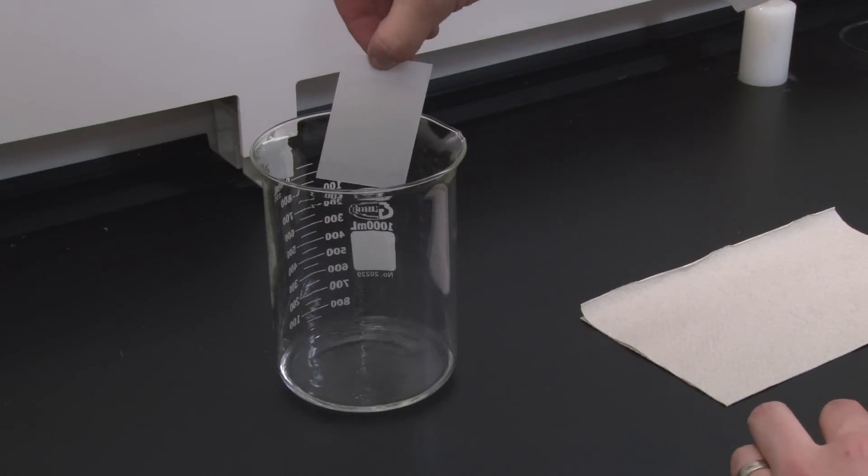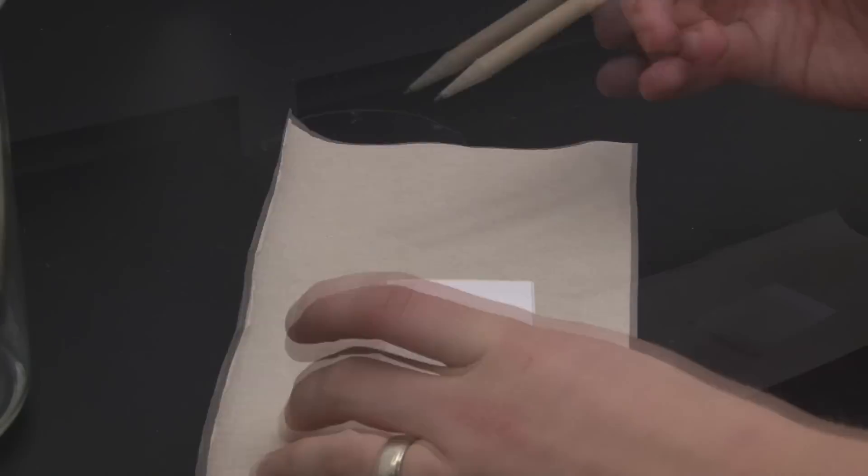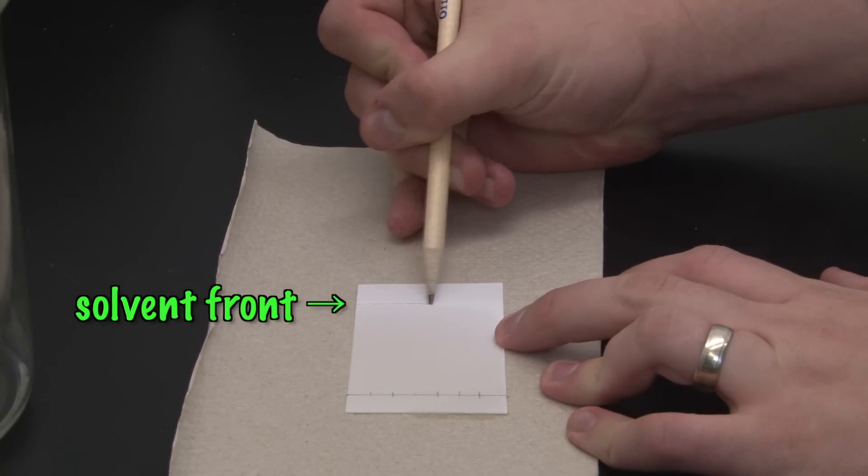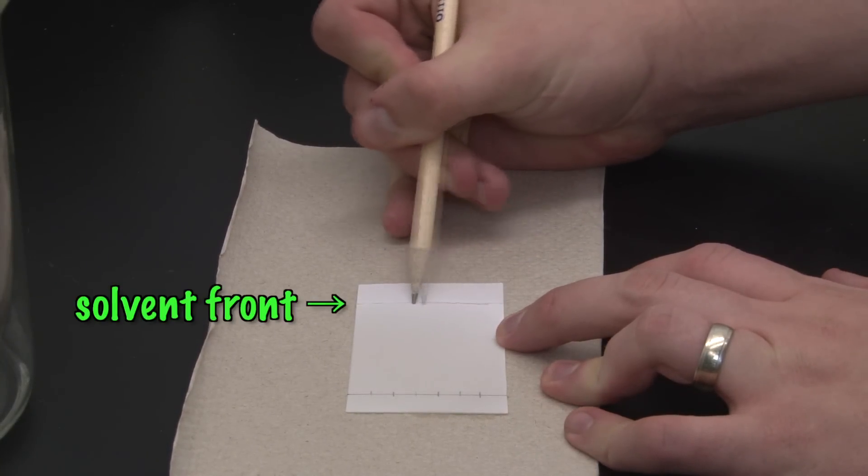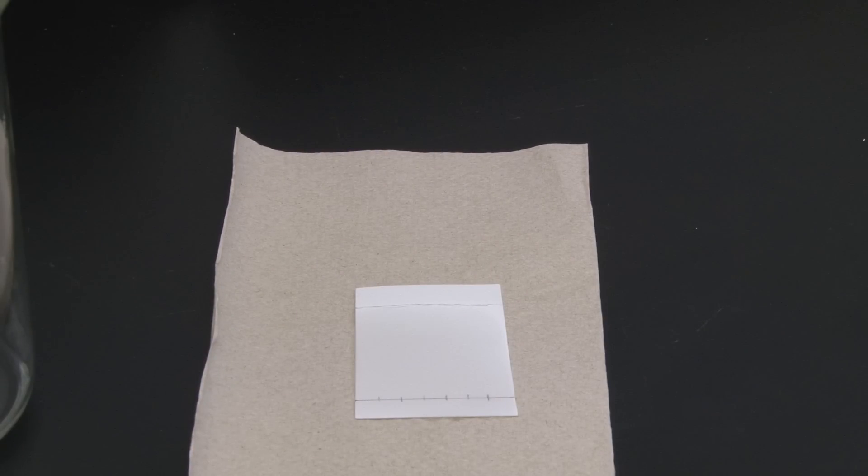Remove the TLC sheet once the solvent has made it up to about one or two centimeters from the top. Place it on a paper towel, and use a pencil to mark the solvent front. We'll need to know later how far the solvent traveled, so be sure to mark it before the solvent evaporates. Leave your sheet under the hood for a few minutes until the solvent has evaporated and your sheet is dry.